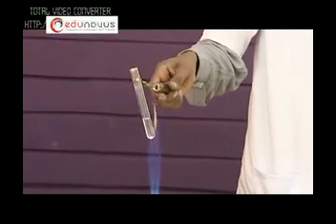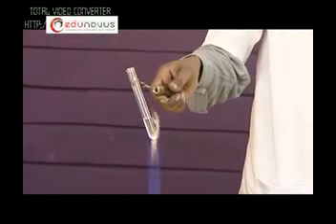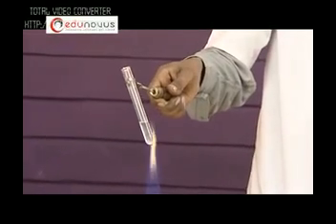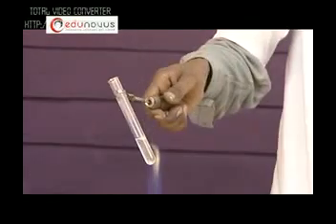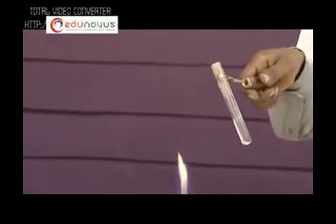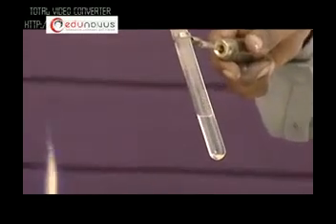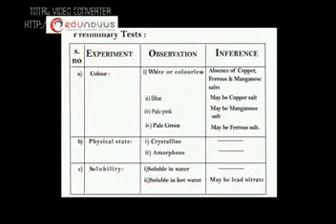Now, we warm the solution. We can observe that the given salt is soluble slowly. Therefore, the given salt is soluble in hot water. Therefore, we can infer that the given salt may be lead nitrate.